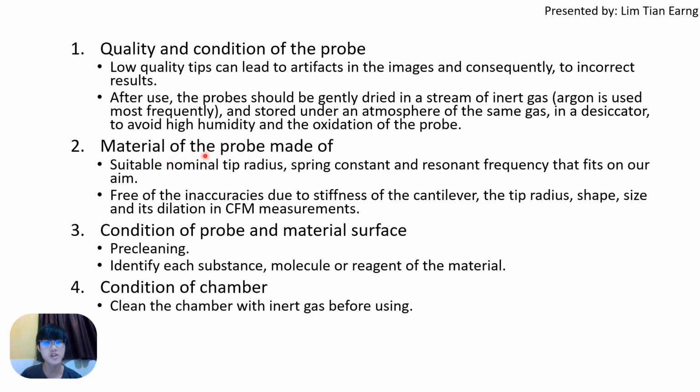If you choose a suitable probe, you will get a better result. And it can be seen in terms of tip radius, spring constants, resonance frequency. So by choosing the correct probe, you can be free of inaccuracies due to the stiffness of the cantilever, the tip radius, and its dilation in CFM measurement.